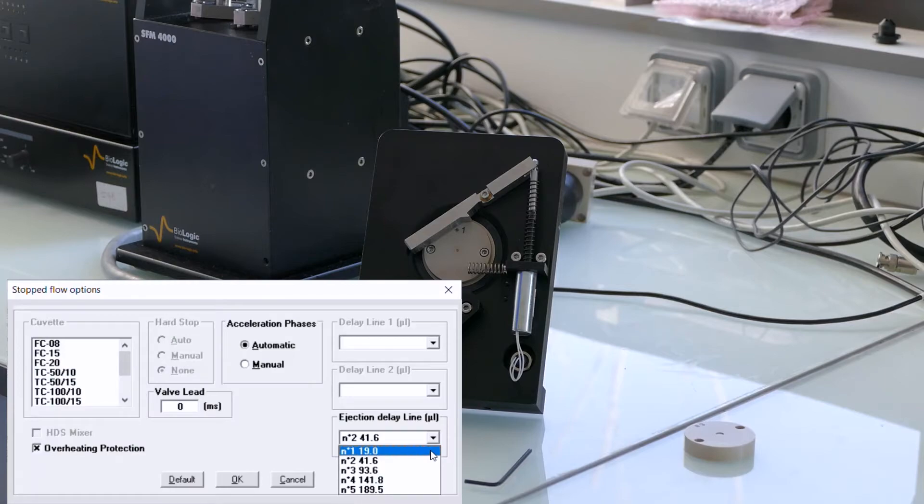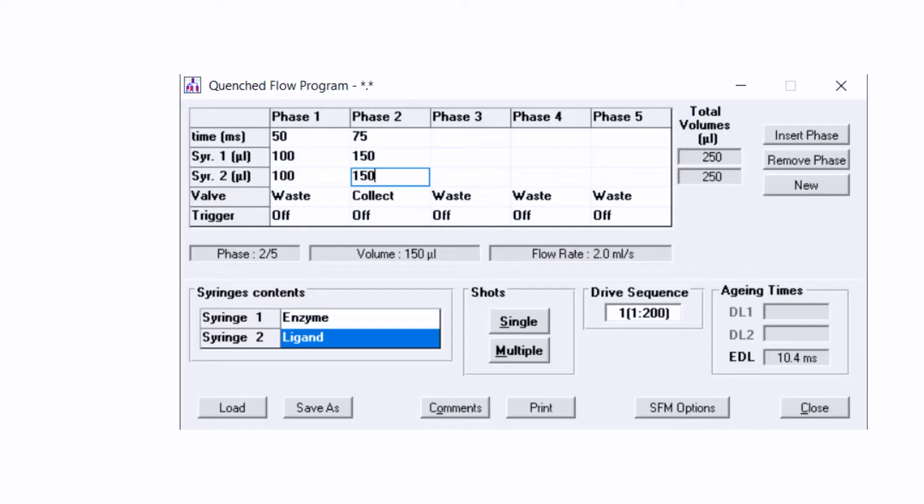Make sure the right delay line is selected in the software and design the mixing sequence by indicating the volume to mix and the aging time you want to reach.